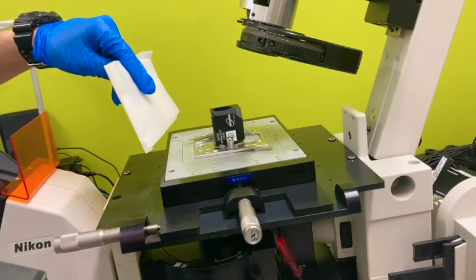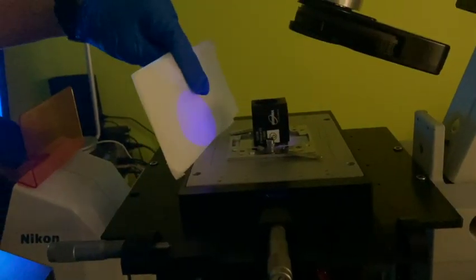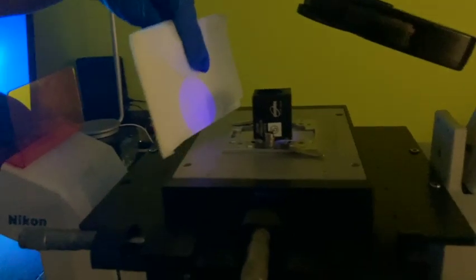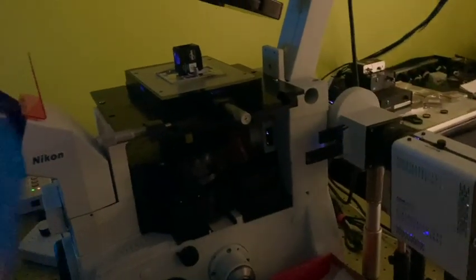Can someone turn off the light so we can see it a little bit? So you can see the blue is reflected in this direction, but we have some yellow coming up. So actually they are separated by the wavelength, and that's a very basic idea of a dichroic mirror and the filter. Okay, the lights back on, thank you.